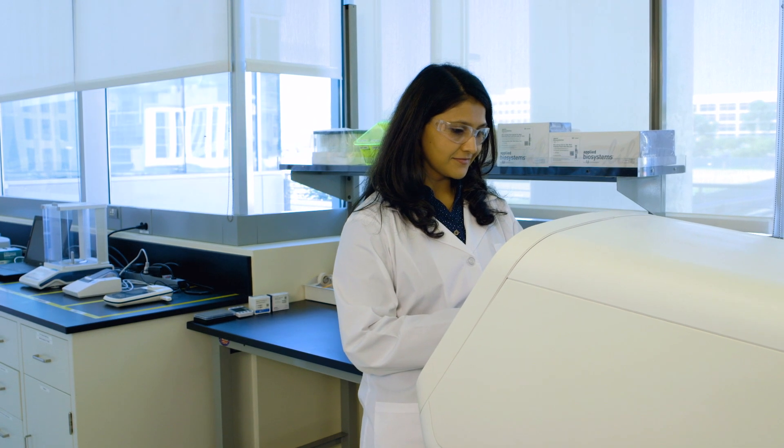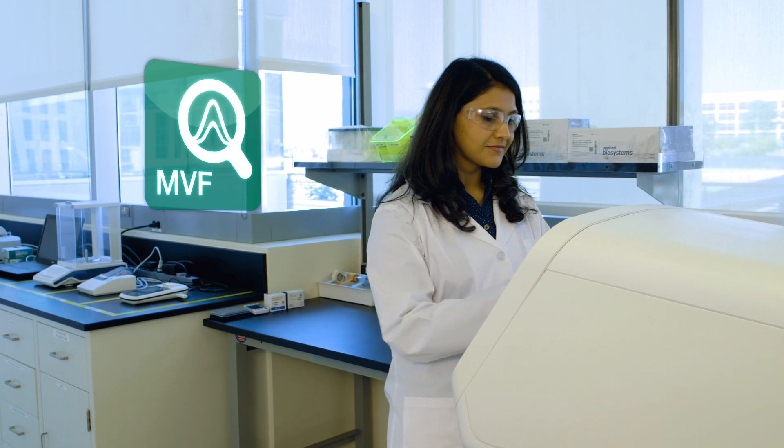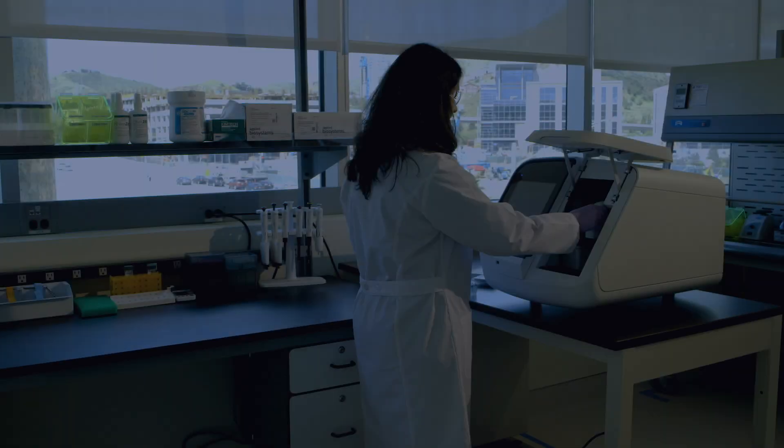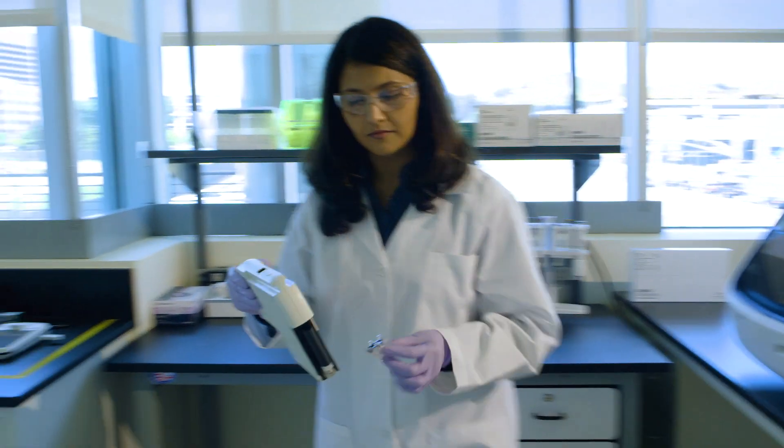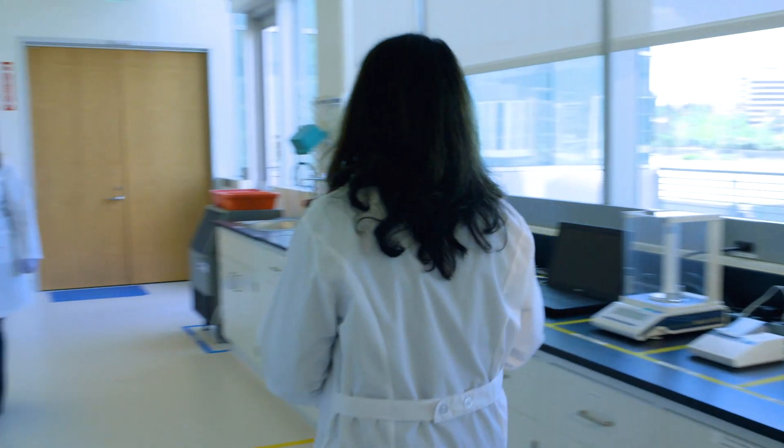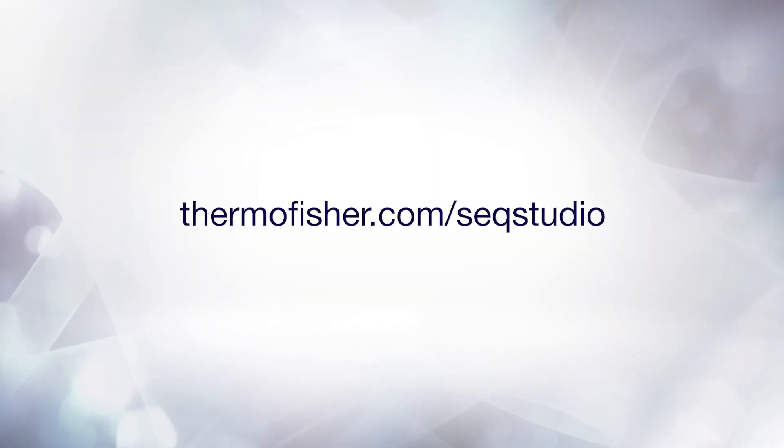This includes minor variant finder software for detection down to 5%. All done—that's all there is to it. To learn more, talk to your local Thermo Fisher Scientific representative or visit us on the web.